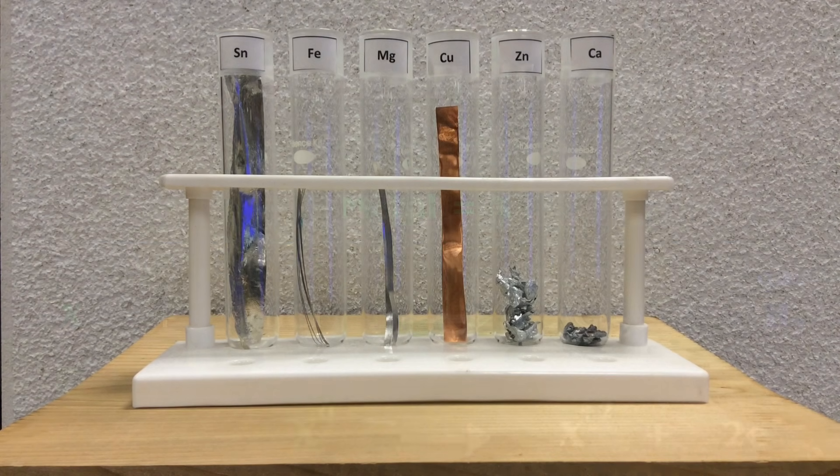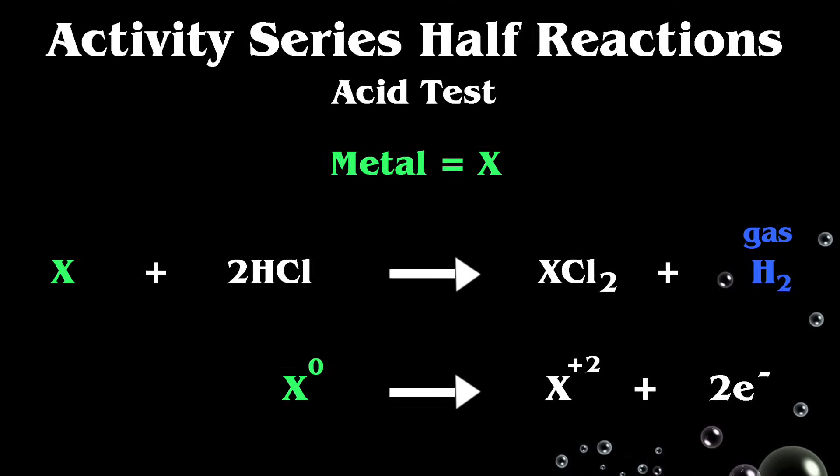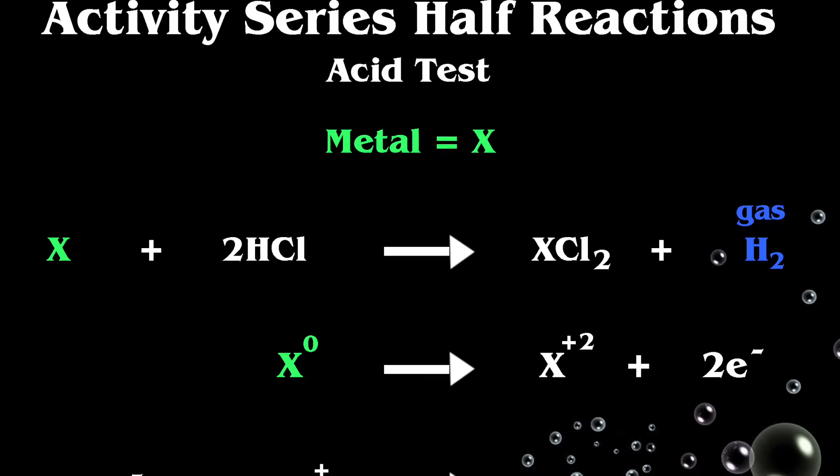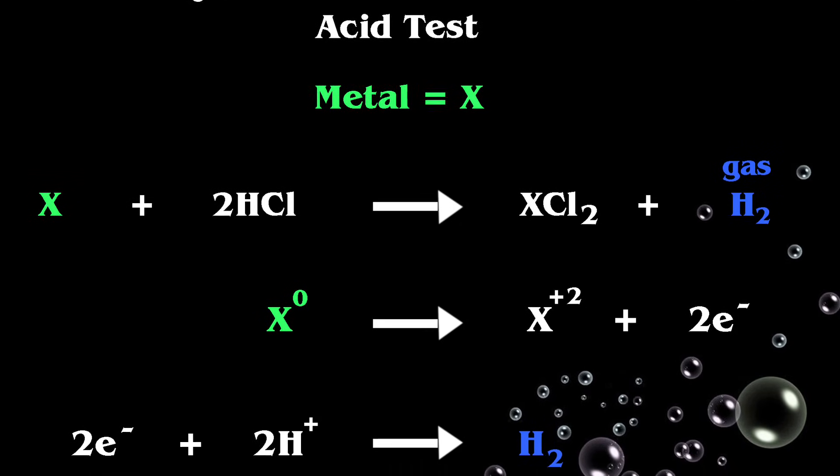The first test, we're going to use hydrochloric acid, which is going to dissociate into free protons. And we're going to see how well the metal can give its electrons to the H pluses, the protons.